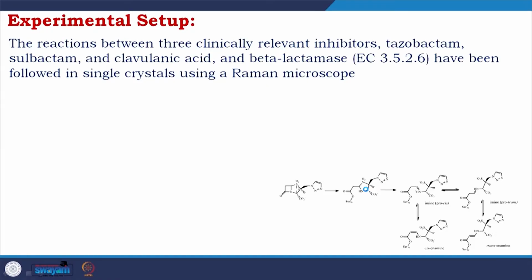So, what experimental setup is developed? The reaction between three clinically relevant inhibitors, tazobactam, sulbactam and clavulanic acid, and beta lactamase has been followed in a single crystal using a Raman microscope, or you could say a Raman crystallography apparatus.